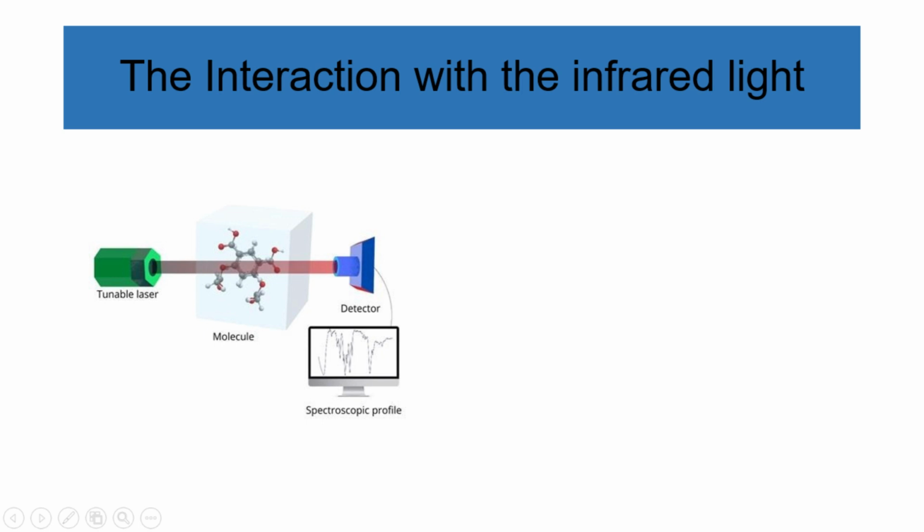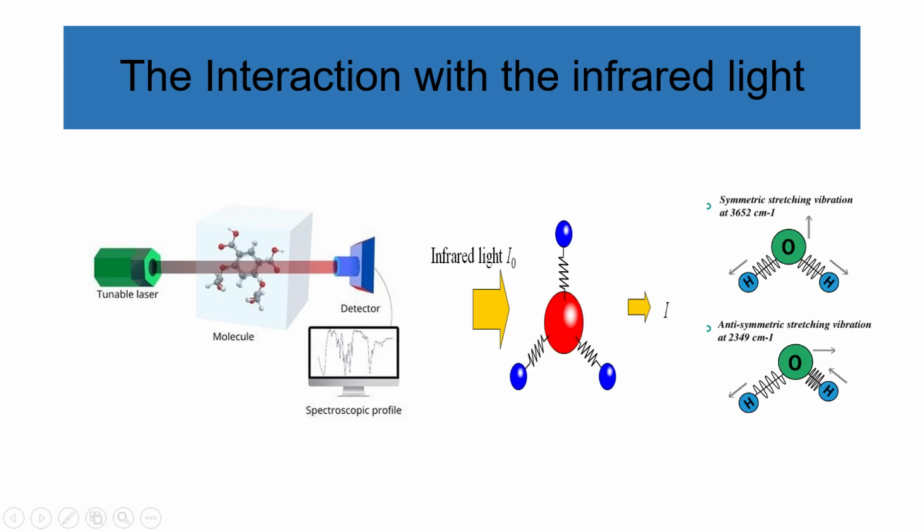Infrared spectroscopy is a powerful analytical technique that identifies and analyzes chemical compounds based on their interaction with infrared light. It involves the interaction of matter with infrared radiation. IR radiation primarily induces vibrational and rotational motions of molecules rather than causing electron excitation or ionization. When infrared waves encounter a substance, they interact with the molecules differently. These interactions mainly involve vibrational and rotational motions. The substance can absorb, transmit, or reflect infrared waves.